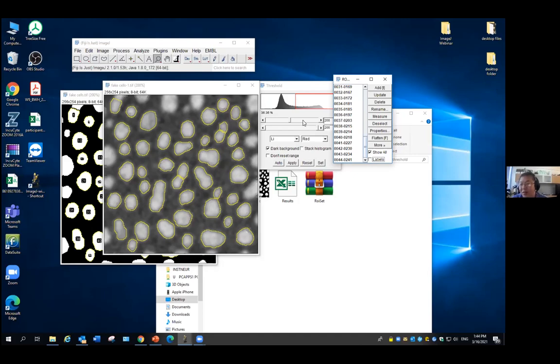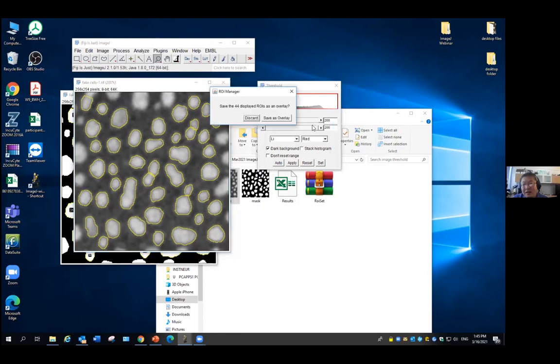For every single image, you can always play with it long enough to get the best result you can. But that's not the point. Our point is to find the protocol which you can apply to all the images. And then you use the same protocol on those images, then I get the result. Then the results are comparable. Like for the image size, it's clearly on here, let's say close this.